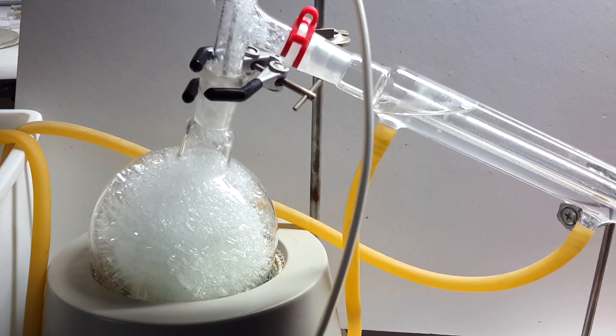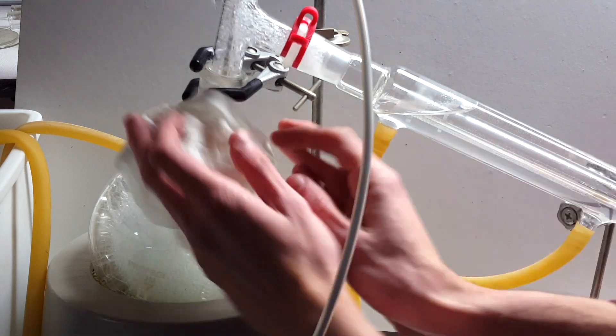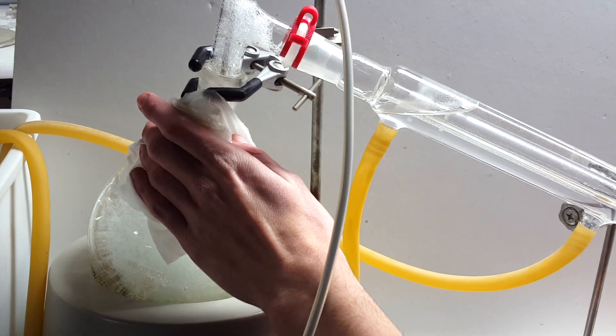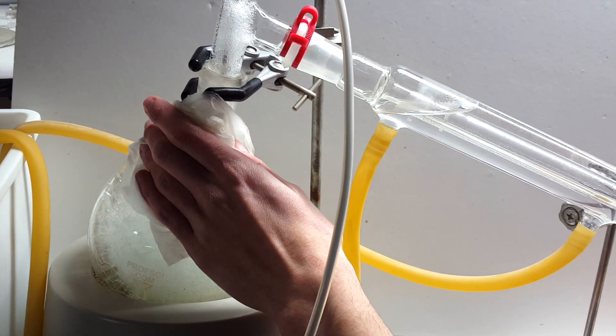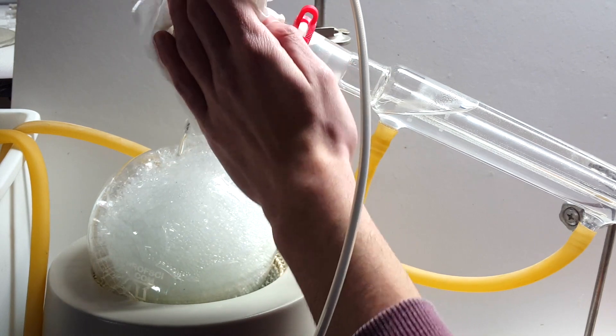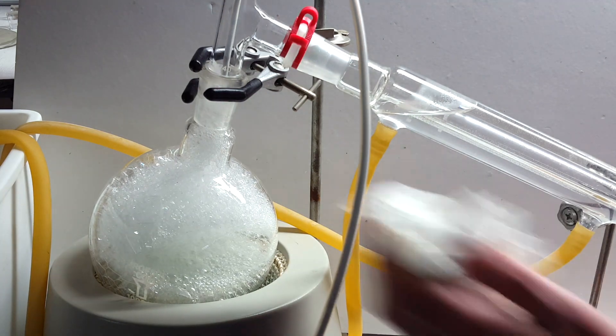There were a couple of times when I was incredibly unlucky, and it did manage to boil over. My solution was to quickly take a wet paper towel and put it against the flask and the temperature adapter, cooling the gases down enough to prevent them from going over. Of course, this did contaminate the water some in the end, but the losses were generally pretty minimal using this method.